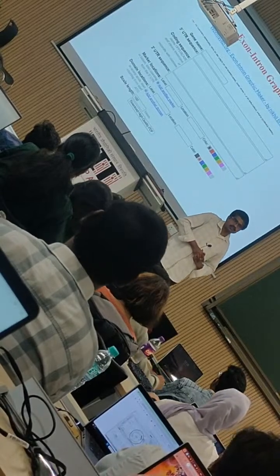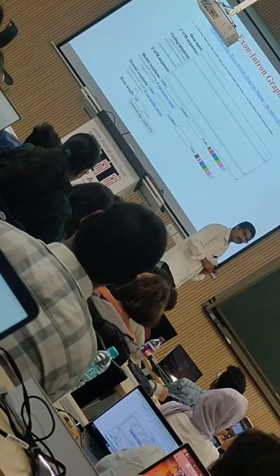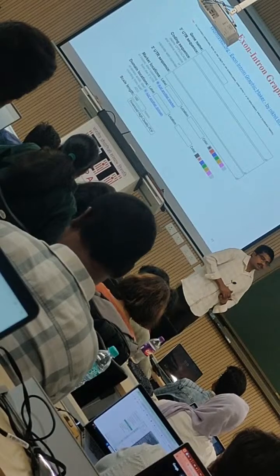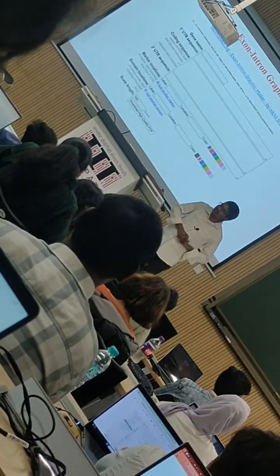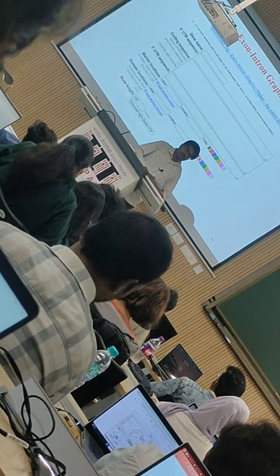I don't know about when I was working previously, I didn't know about this software. Previously we were working in the SnapGene version, but this is a fully non-profit organization software, an intron exon graphic maker. When I was working in GKVK, only at that time could I know about this software. You can easily make the linear diagram. Like I'll show the home page.